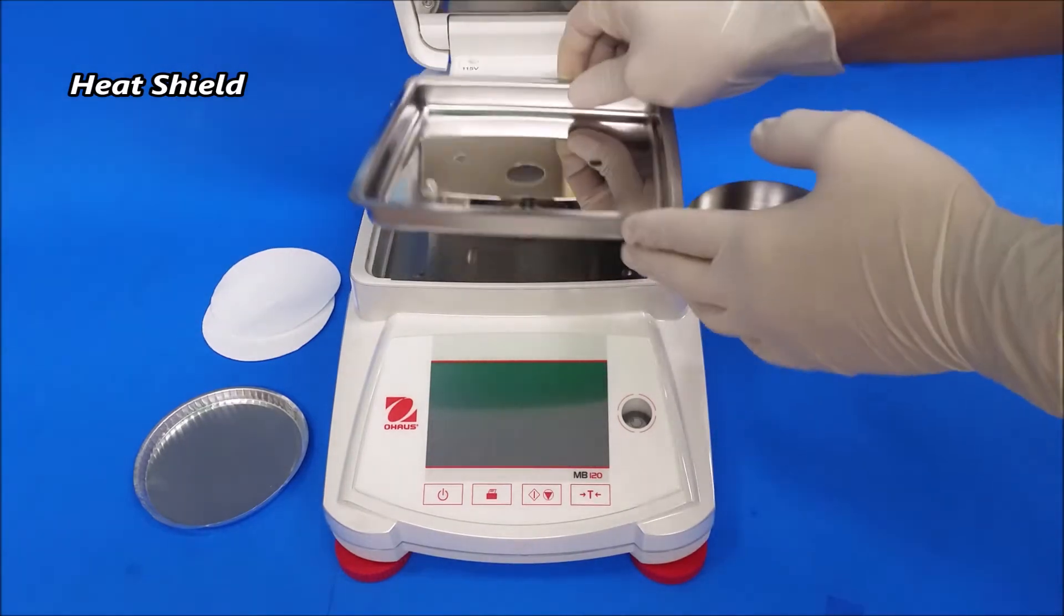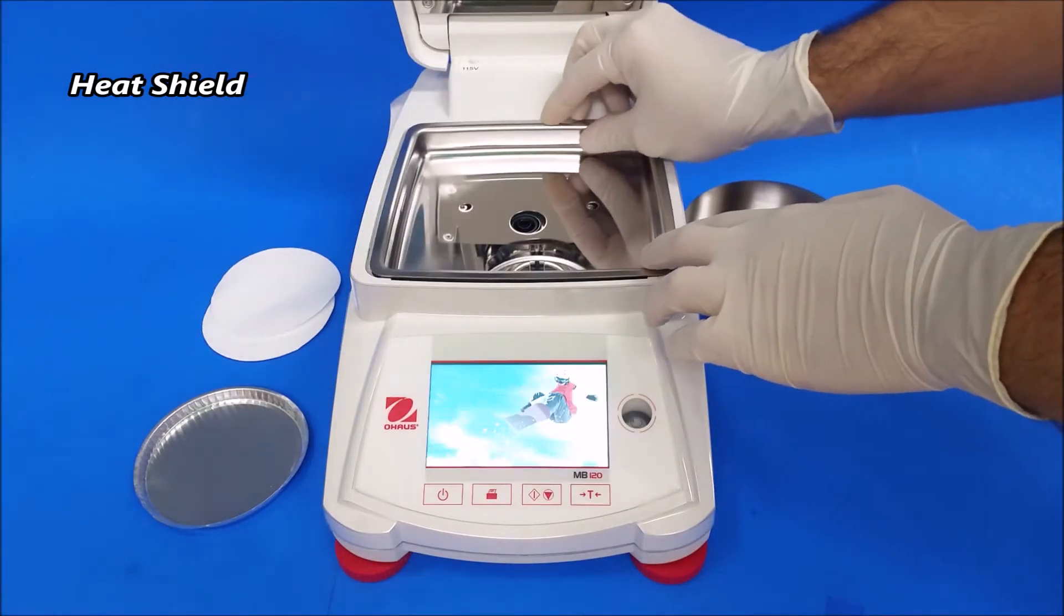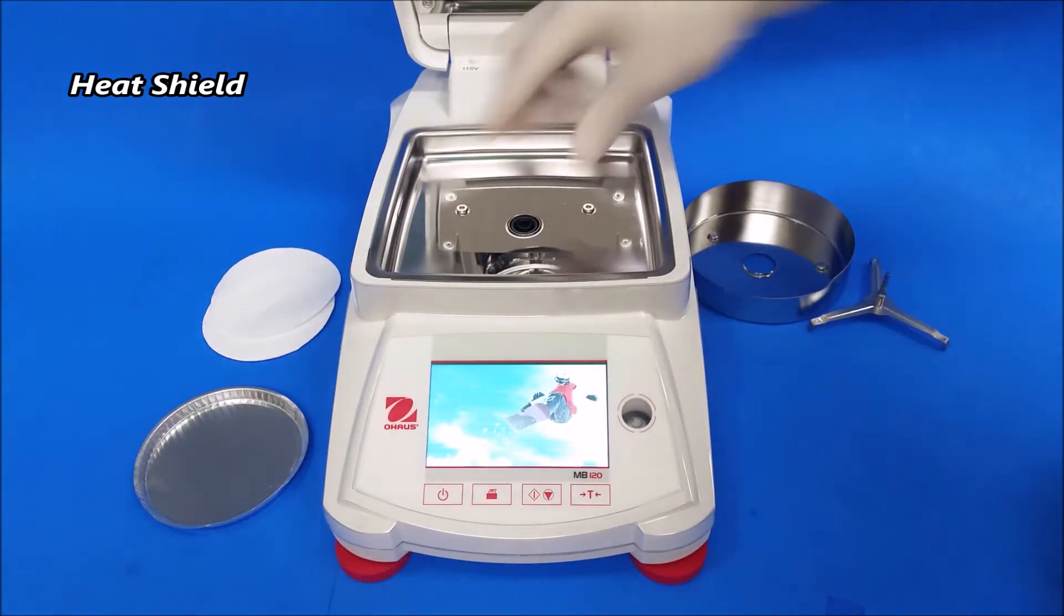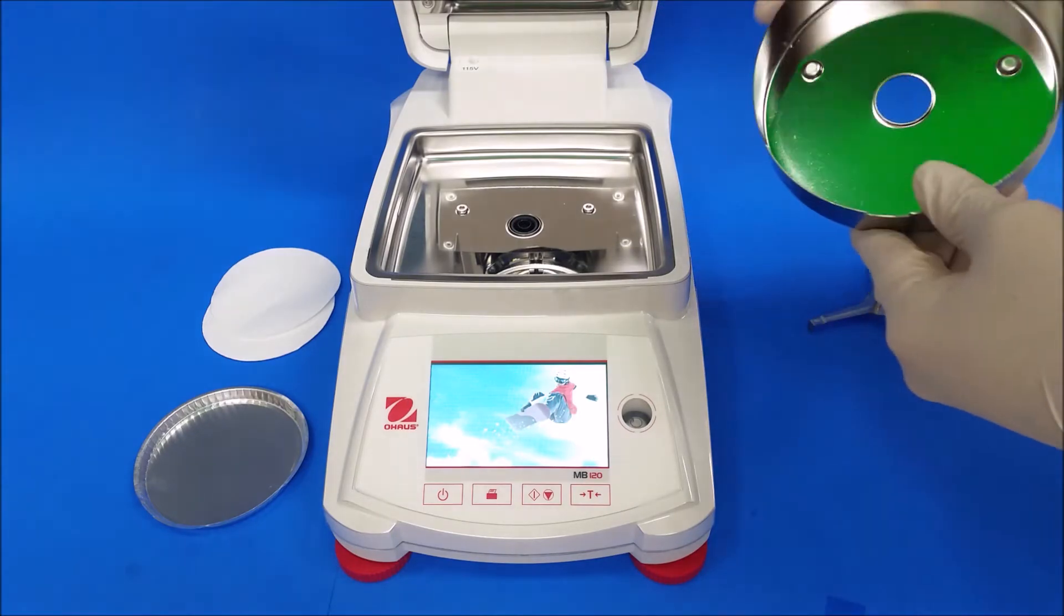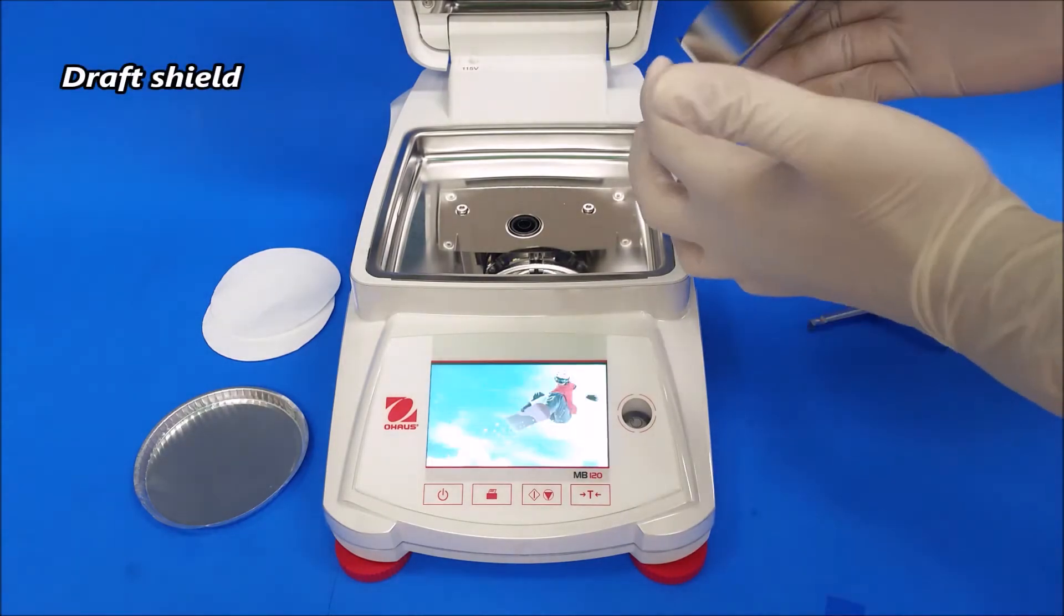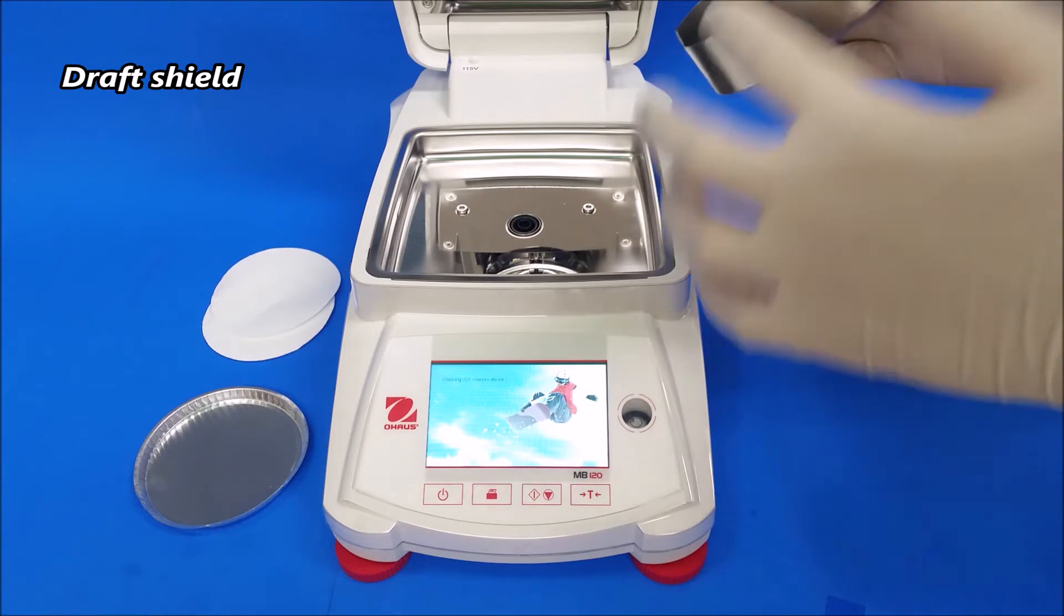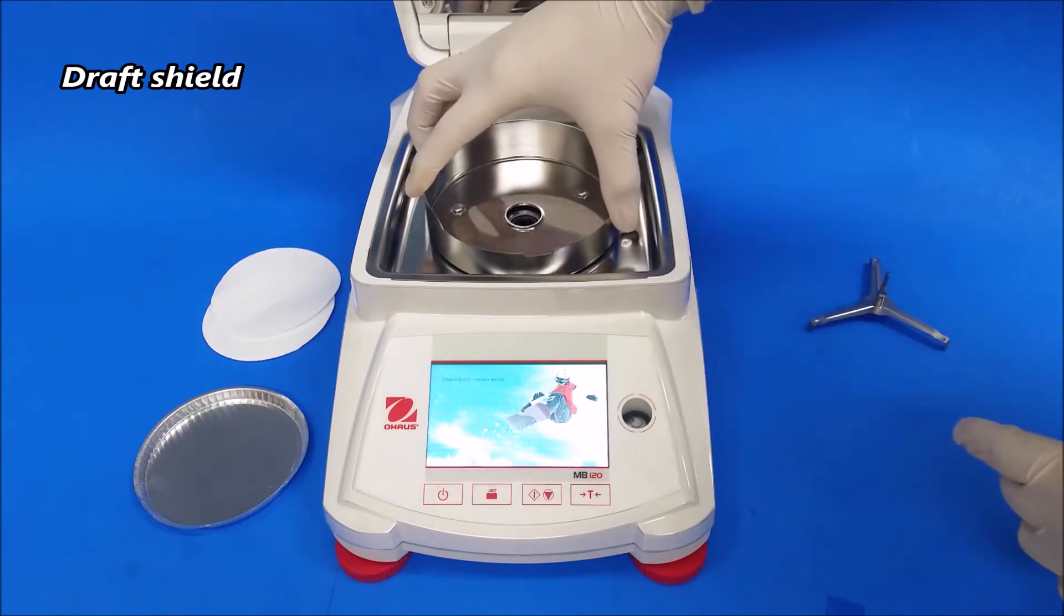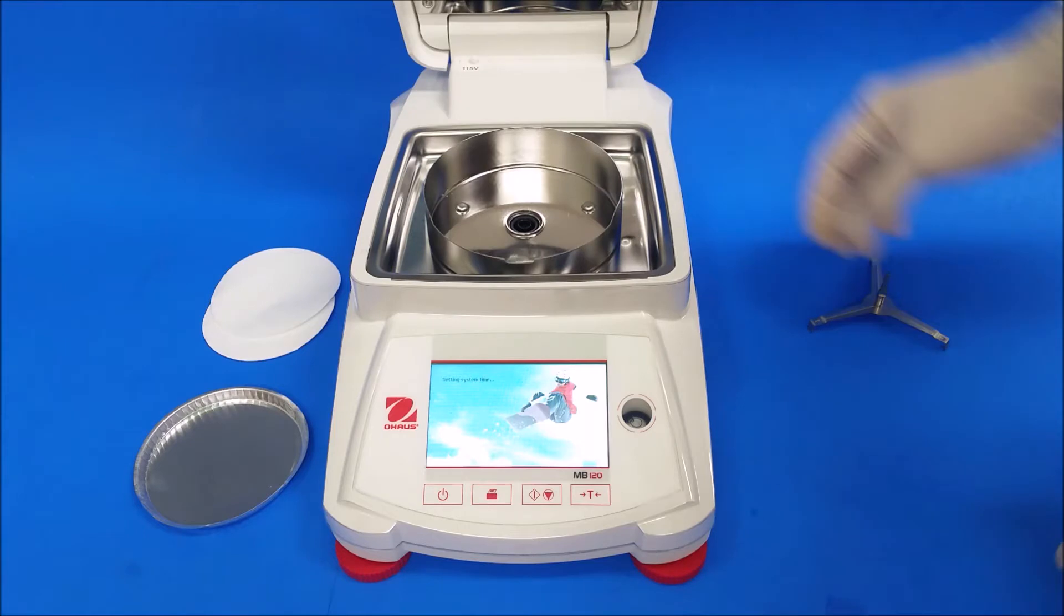First part we're going to put is the heat shield. It should fit perfectly with the two screws here. Next is the draft shield. You can see it has a hole cut through here. It should be facing towards you. Line it up with the screws. It locks in place.